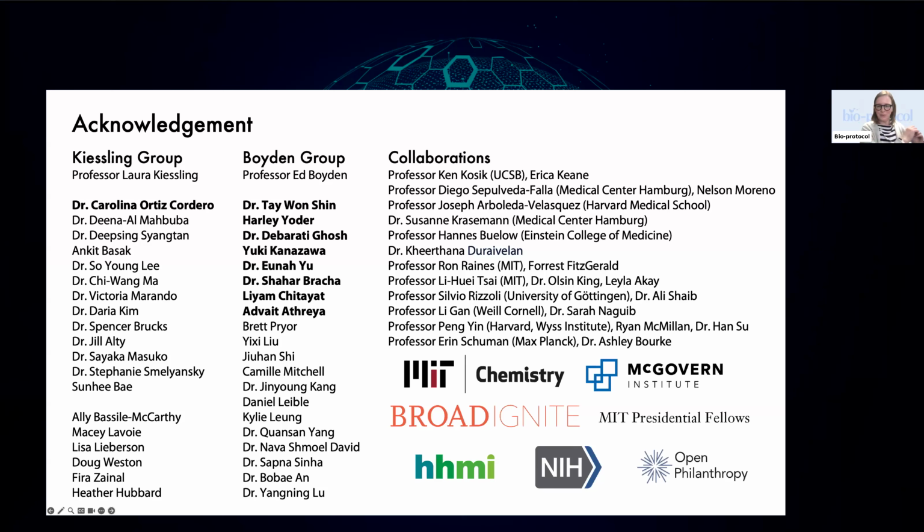Okay, there are two more questions regarding different organisms. Has anyone used it on organoids, and has anyone used viral particles that are between the nuclear membranes? So I'm not sure if anyone has used it on organoids. I think I've heard about it. I think people might have. Viral particles, do you mean expanding viruses themselves?